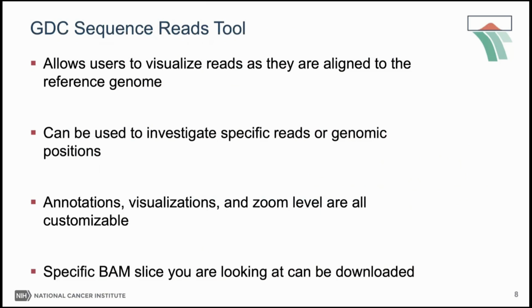Maybe you found something interesting and you want to see why a variant caller made that specific call. This can all be visually investigated using this tool. Also, annotations, visualizations, and zoom levels are all customizable in the tool. So those features will be demonstrated by Kangyu in a bit.